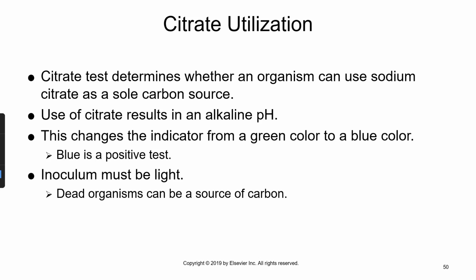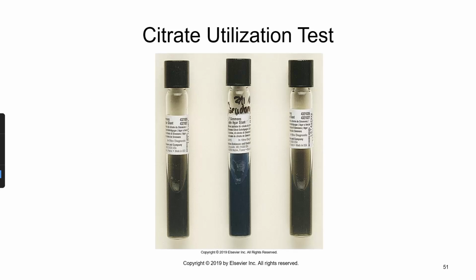The inoculum must be light. Dead organisms can be a source of carbon, so you do not want to over-inoculate the slant. This is really hard to distinguish, but you can see that this is green, this is blue, and this is green. So blue would be positive.